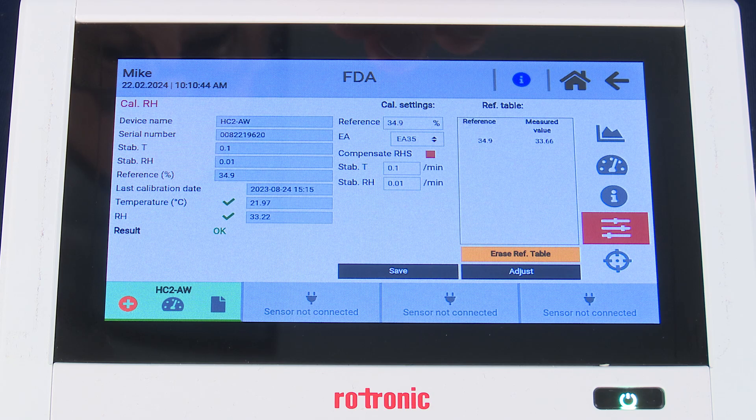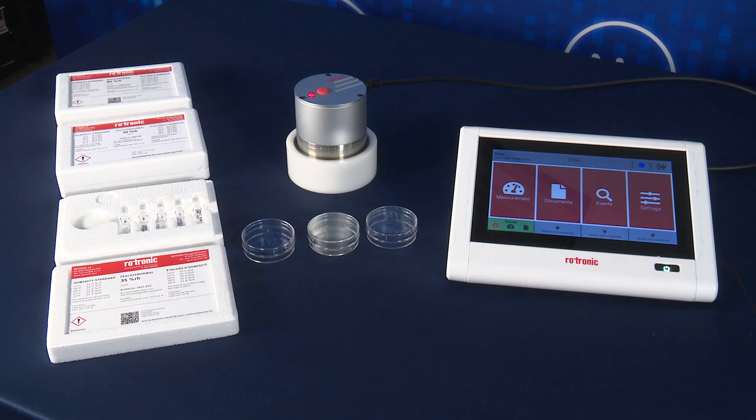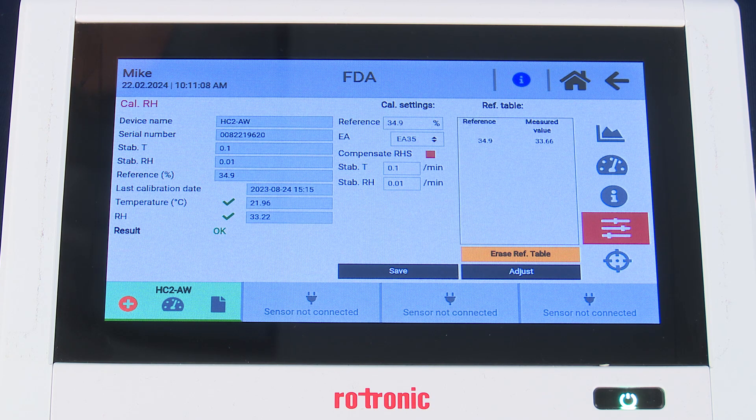Once we've saved the calibration point, you'll see the new display appear. It will populate the reference table with the reference value and the measured value. From here, we want to proceed to our second point. We recommend three points, lowest to highest. It's important to mention that each calibration point influences the accuracy of the calibration curve, and adding the same point multiple times can disrupt the process — please do not add the same calibration point more than once.